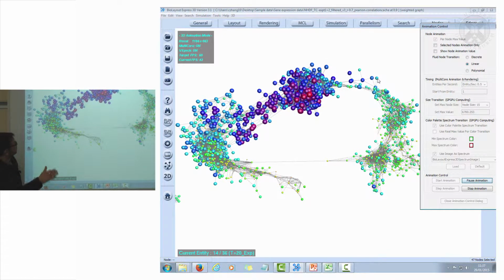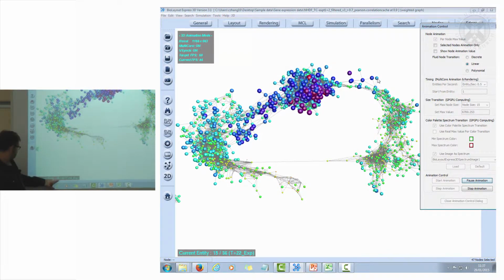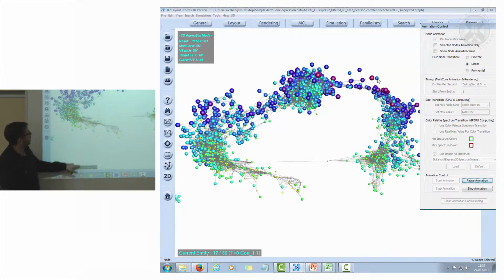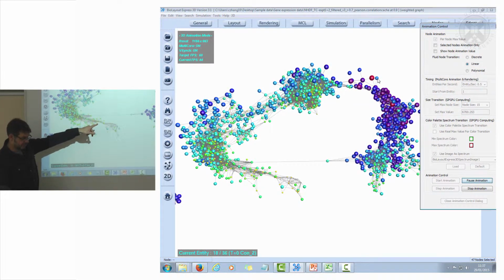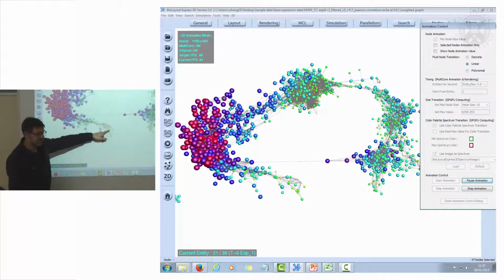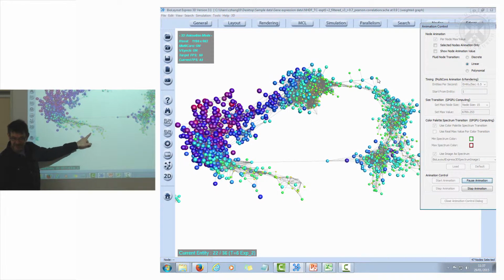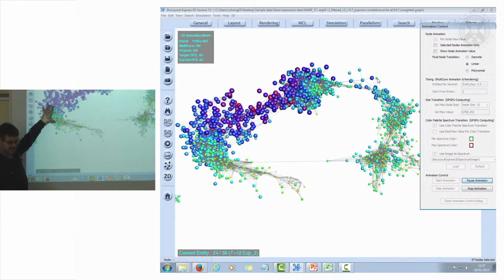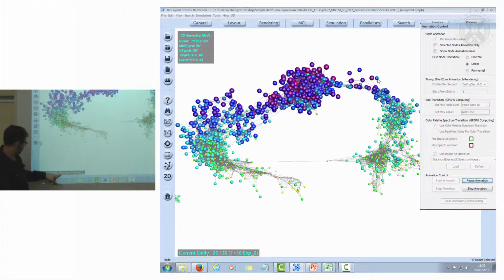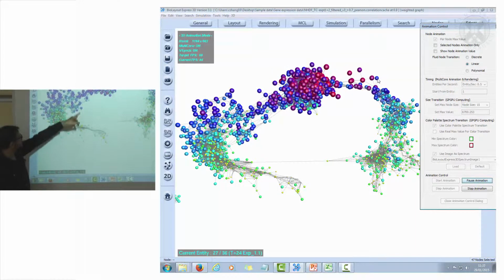And then actually the second experiment will kick in. So we're on the 24 hours, and now we're back to control, second experiment. Okay. So you can watch this nice response going off. Now you see we almost didn't see these guys light up the second time round because there were no 1 to 2 hour samples. So we went straight to the 6 hour event, and what you'll see after about 24 hours on here is you don't really see much happening up here.